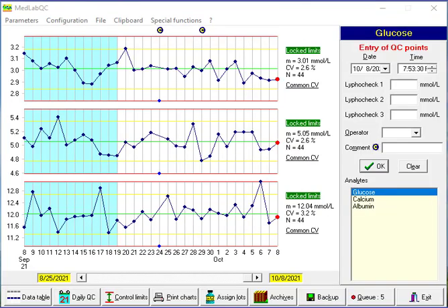Hello everybody, in this tutorial I'm about to talk about MedLab QC software which is used to quality control different analyses in a medical laboratory.